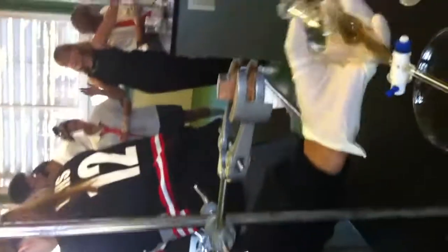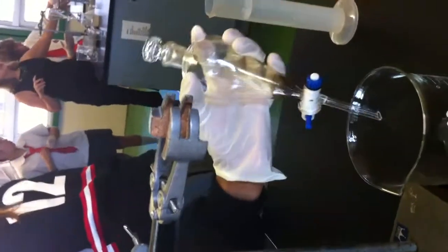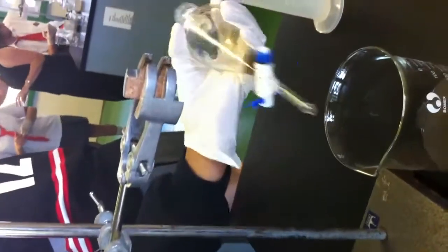I need you to listen because this isn't my lab. I'm going to have to bring a bottle over to collect the residue from your beakers. All your dirty glass goes in the white tray out the front. Now, clean away as much mess as you can. When you've got the rest with the calcium chloride in it, I'll bring some stuff and cover the beakers.